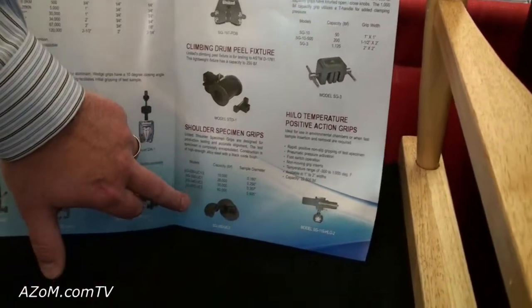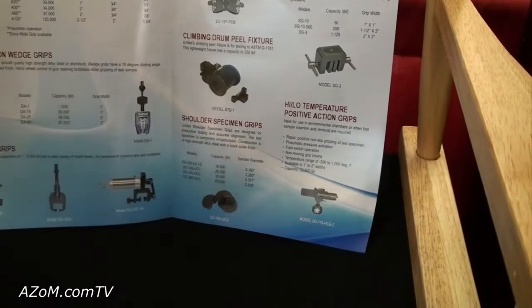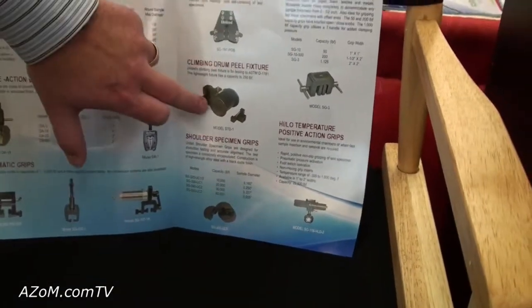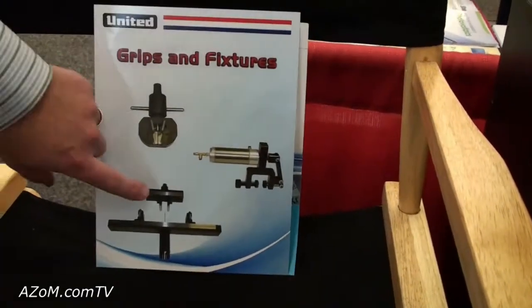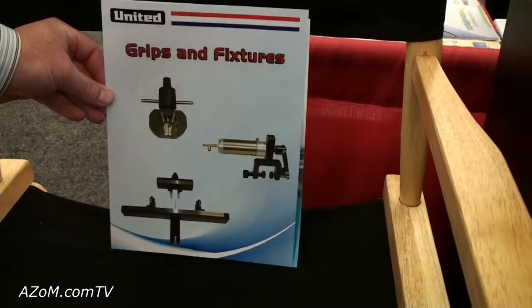This is like a shoulder specimen grip for your foundries and similar applications. Climbing drum peel fixture. Right there is going to be your 4-point and 3-point bend.